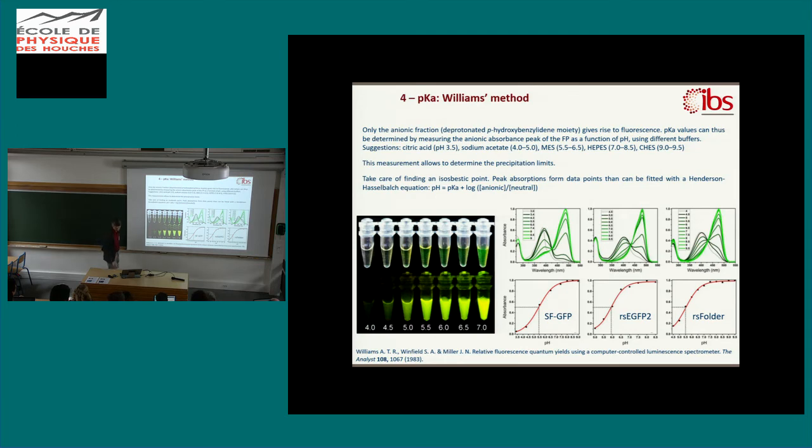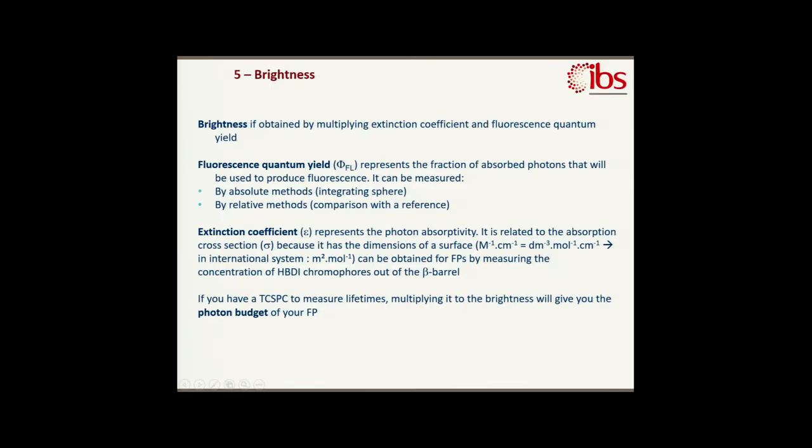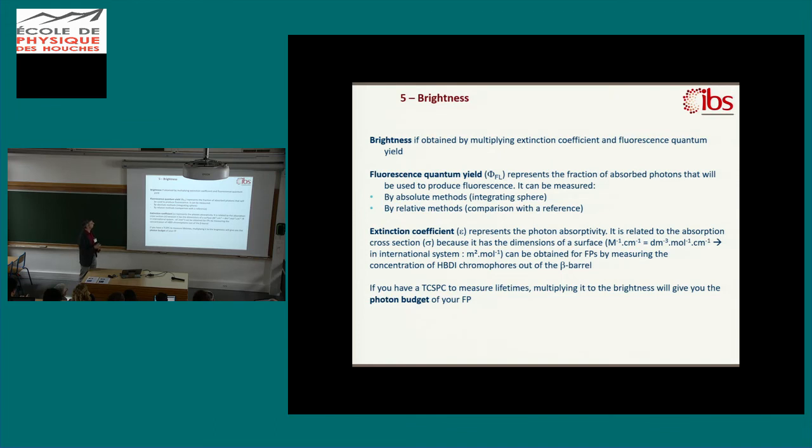Okay. So fast. Brightness. Brightness is determined by the product of the quantum yield of fluorescence and the excitation extinction coefficient. So that's what I say here. So you can obtain your fluorescence quantum yield by two methods, either by absolute methods or by relative methods, I will explain to you.